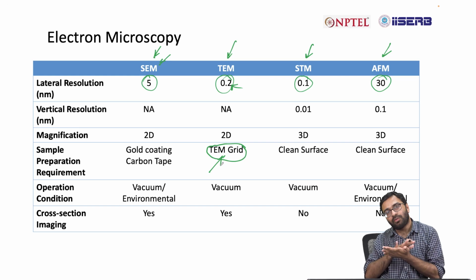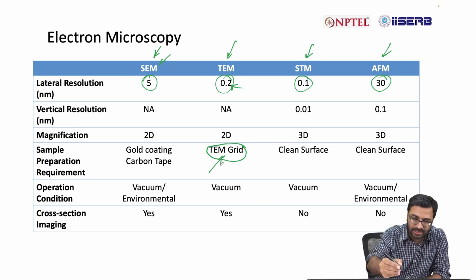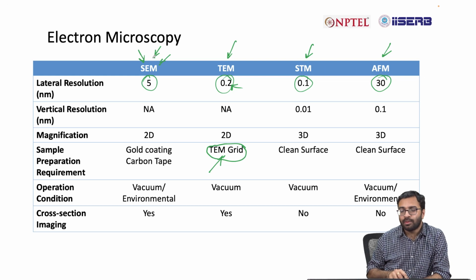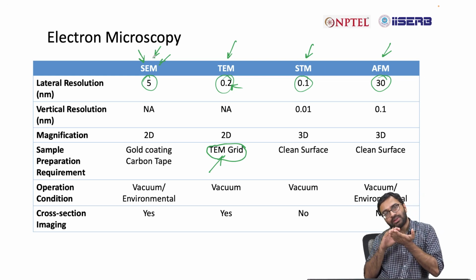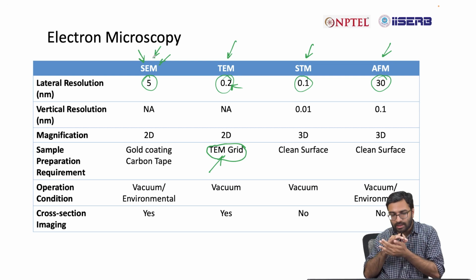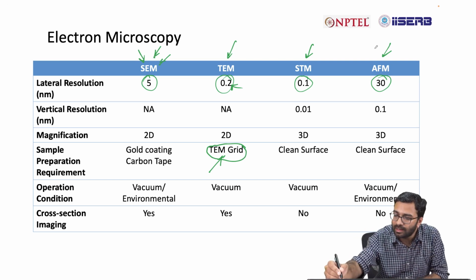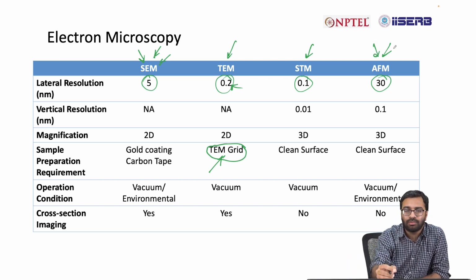If it's a thin film over an opaque substrate, then AFM is the best method to detect the same. If there are a lot of features present on the substrate and you want information regarding the height of those features at various locations, then AFM is again the best one to use.